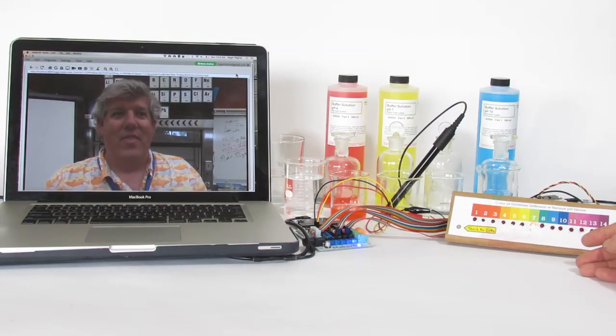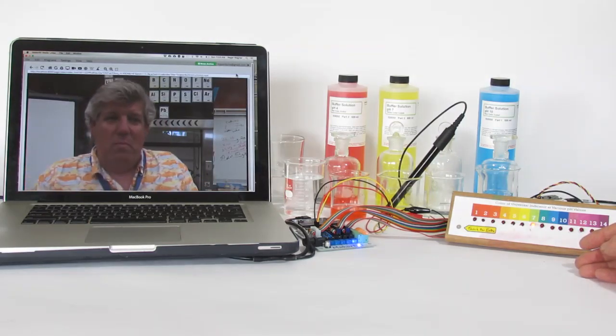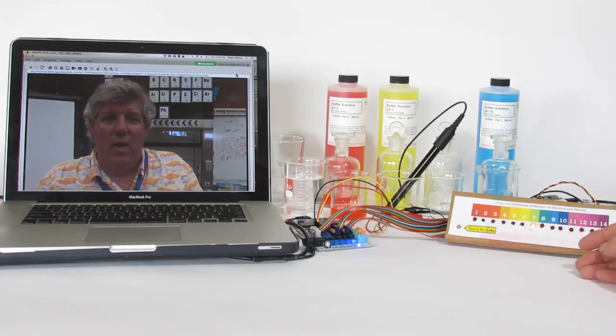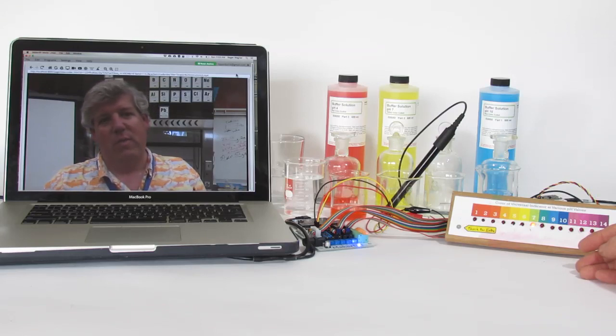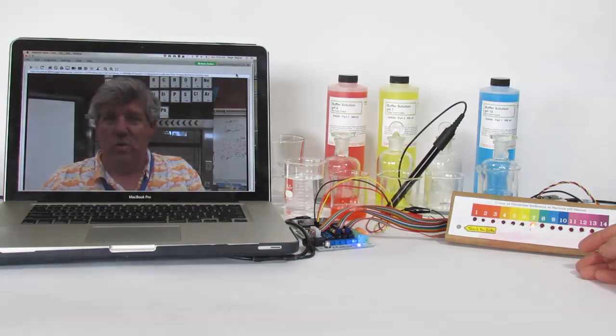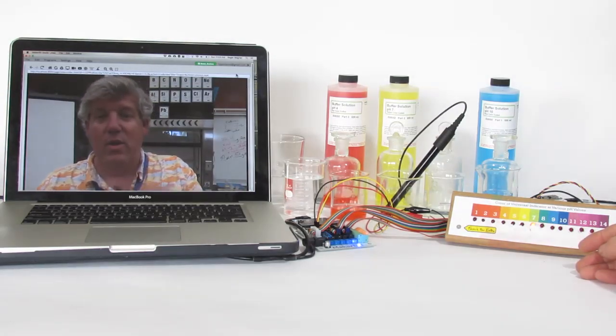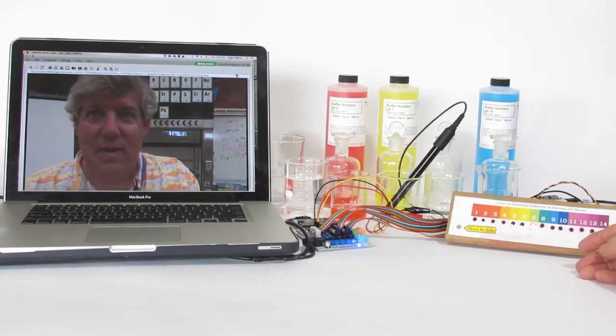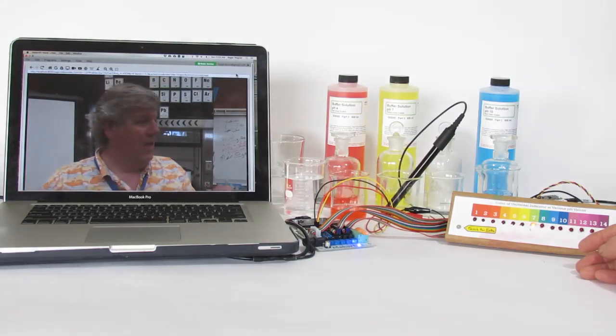Wow! You're at a pH of 7! That means you're on the way. Now you've reached a neutralization, but you have an unknown acid. So we are going to continue on until the point that we've reached that complete neutralization point, which now you need to be looking at your indicator of phenolphthalein and be looking at the LEDs.